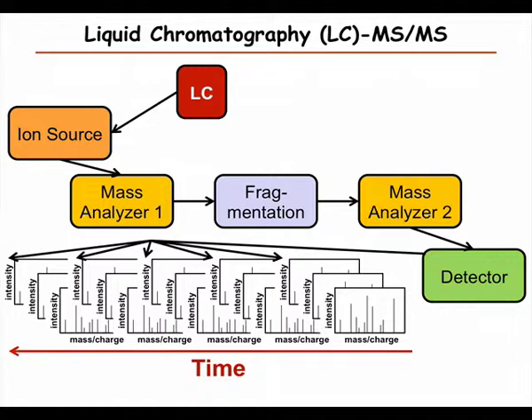and then collecting a lot of spectra. So I mean, typically one would run maybe a 2-3 hour run and collect up to even 50,000 spectra. So that's the sort of magnitude.